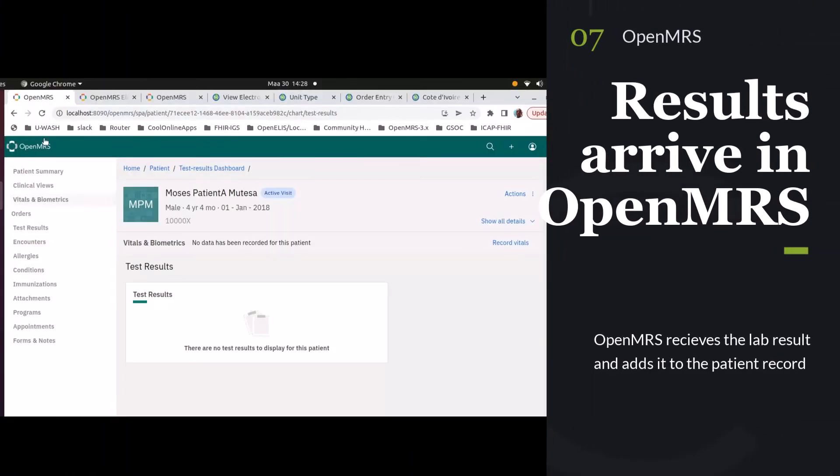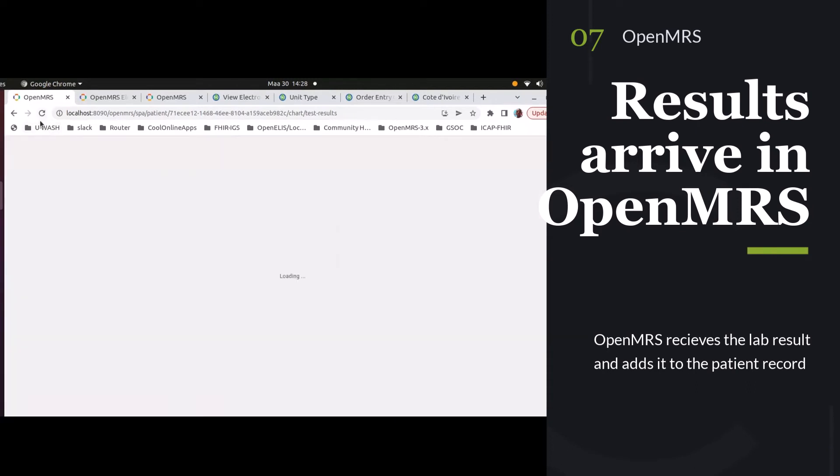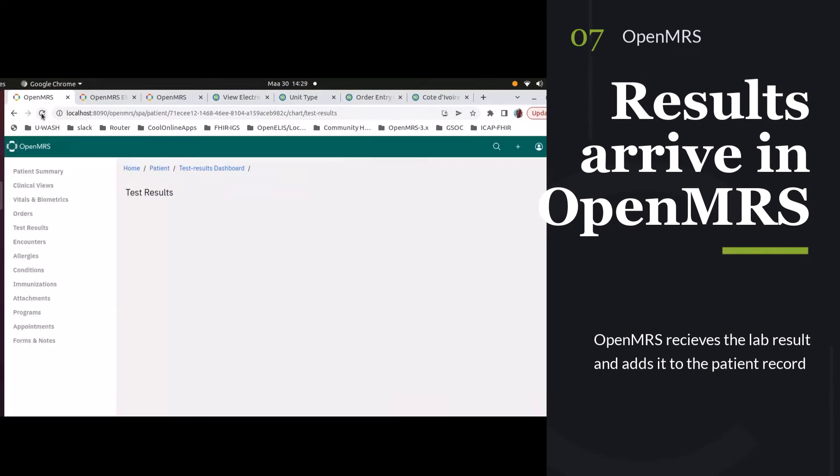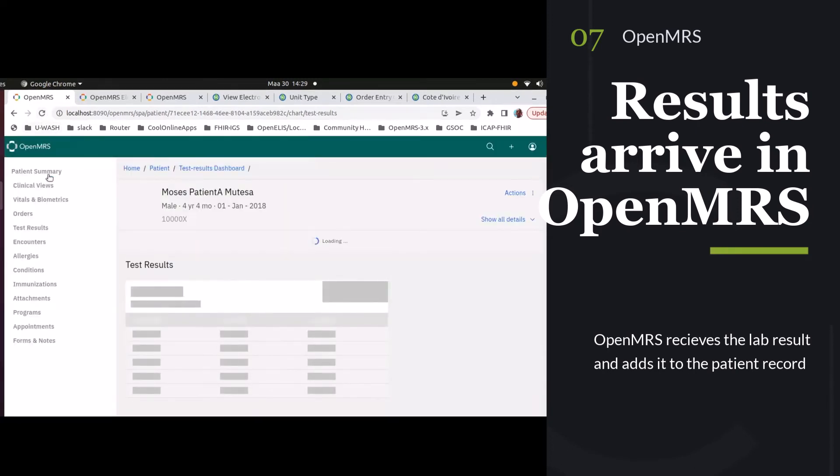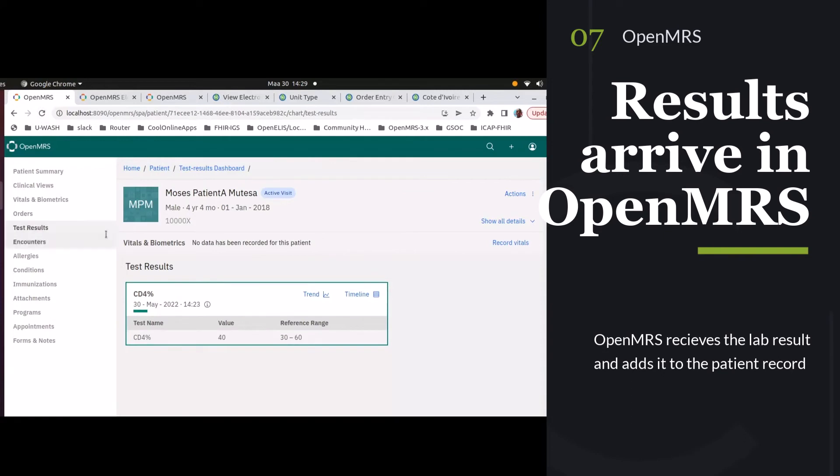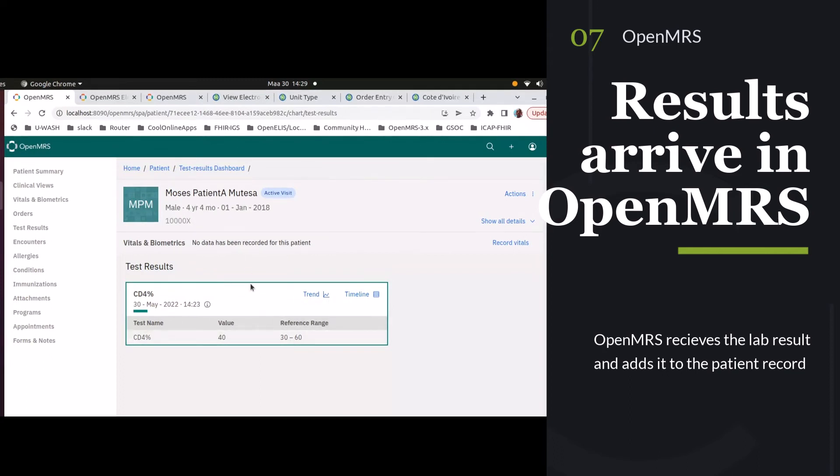And now we've got our test patient here. You can see that we have our result of 40 that is now back in our patient record. So that is the round-trip result between ordering a test and getting those results back in OpenMRS.